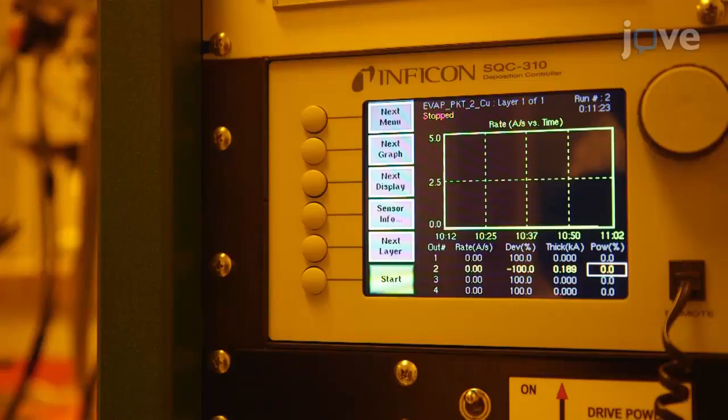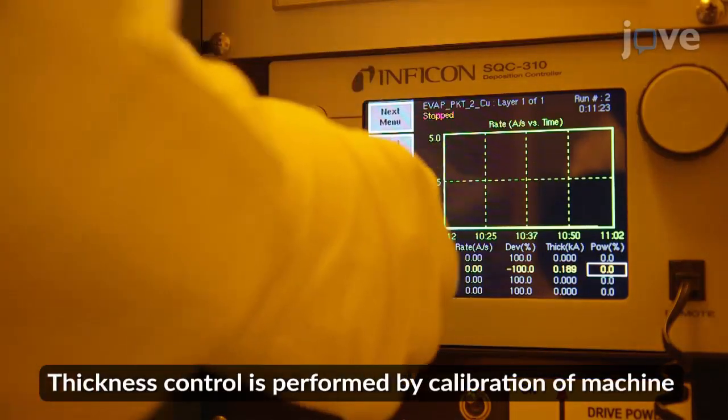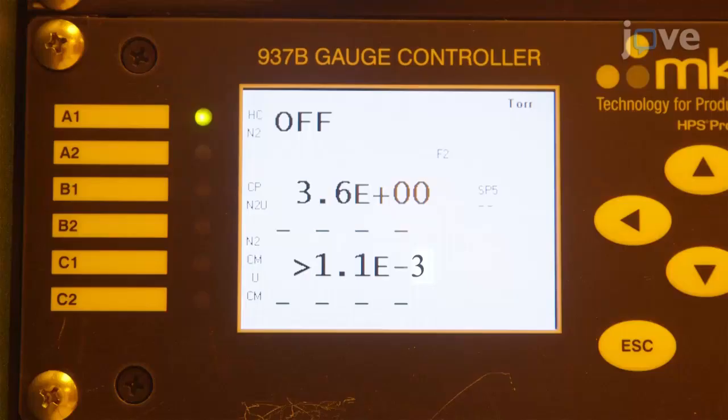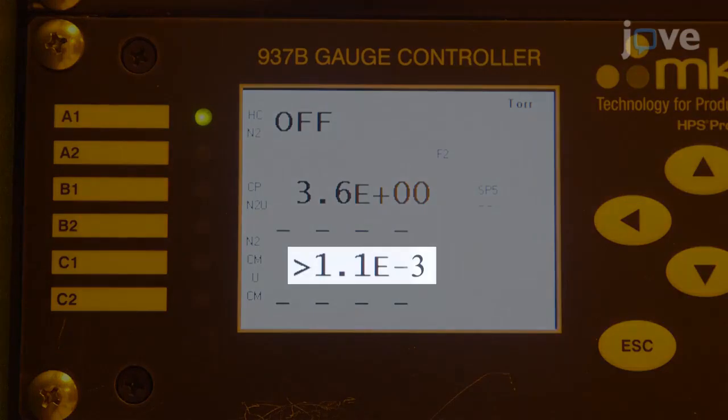Using the thermal evaporator system, deposit the gold film at the desired thickness, which is 5 nanometers in this experiment. At the second deposition stage, the argon pressure is 1 to 5 millitorr, and the range is given as different pressures are chosen to calibrate for the deposition rate.